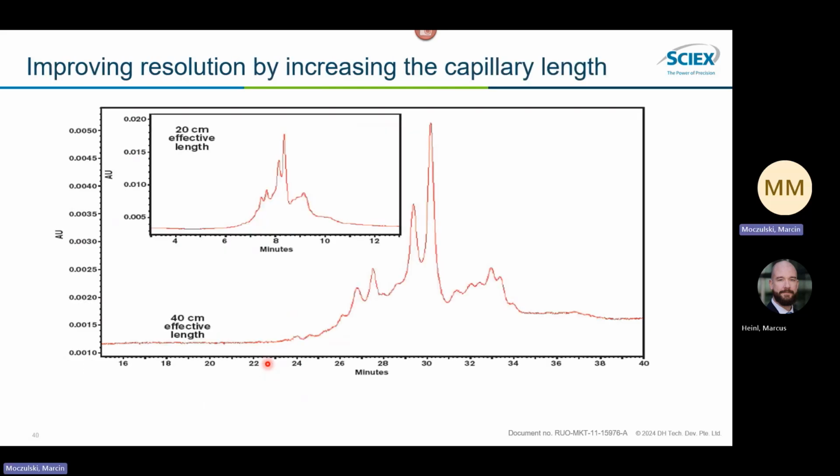We are also flexible with capillary lengths. The 30 centimeters mentioned allows us to be much more efficient with separation time. However, it might not be sufficient to determine resolution related to basic or acidic forms. If higher resolution is needed, we can elongate the effective separation capillary length, typically doubling it, meaning instead of 20 effective, we can use 40 effective centimeters.